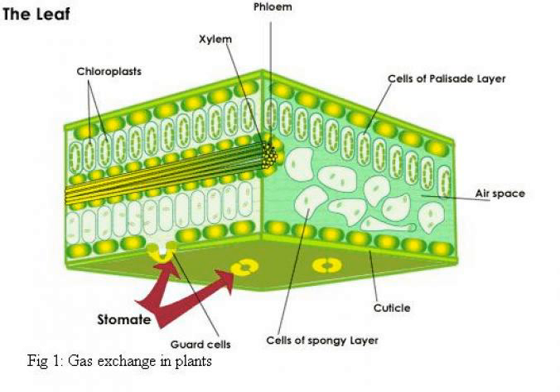6. Repeat this process for the top also and for each of the collected leaves. Be sure to label each slide. Organization of data is critical. 7. Observe the casts from the top and bottom of each leaf on high power.